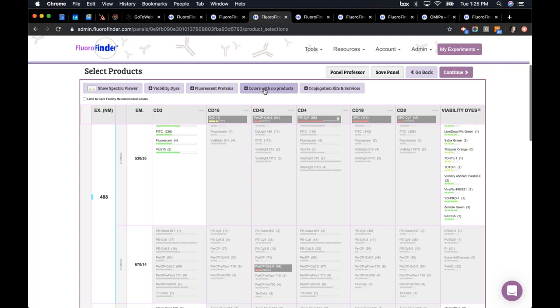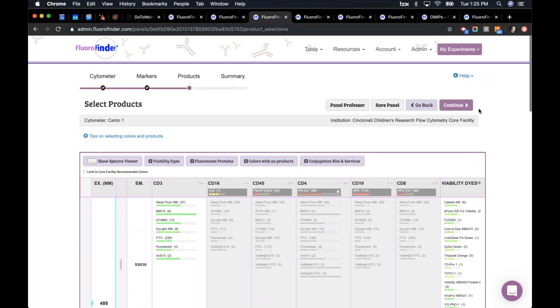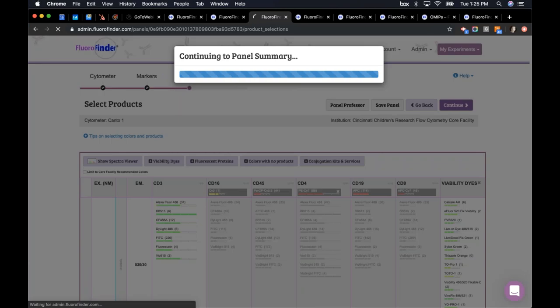If you're doing custom conjugations, click the 'Colors with No Products Available' button. That way any fluorochrome — or if you have a marker with no commercially available products but you conjugate it in your lab — you can use this to assign any color to any marker in your panel. It's a nice touch. When you're done, continue to the panel summary page, which is the final page on FloraFinder.